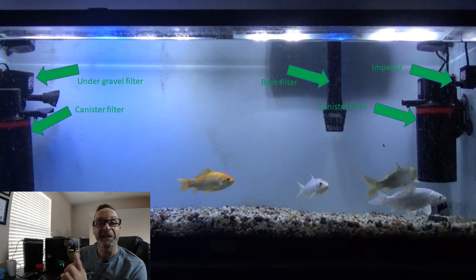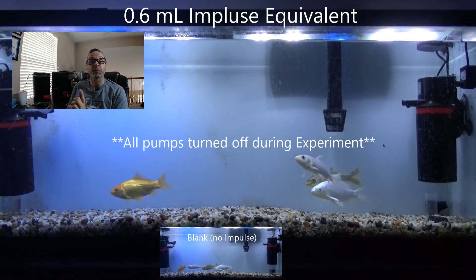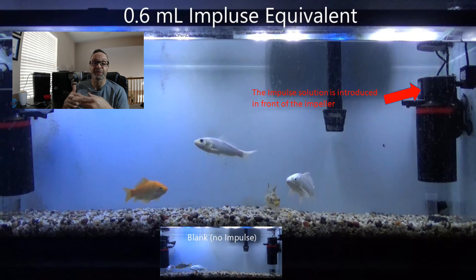Okay, so that's the setup. Let's look at some experiments. We're about to add the first, smallest concentration of stimulant into the tank. We simply pour the solution in front of an impeller, which makes the solution spread throughout the whole tank. So we'll see that, and then we'll see the fish's behavior in response to that addition.